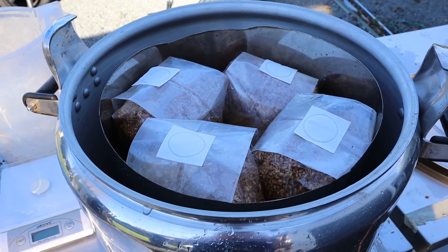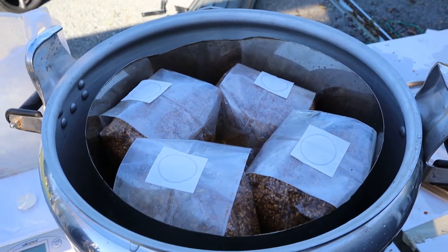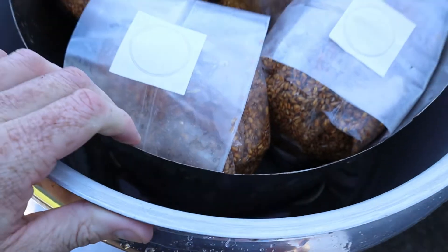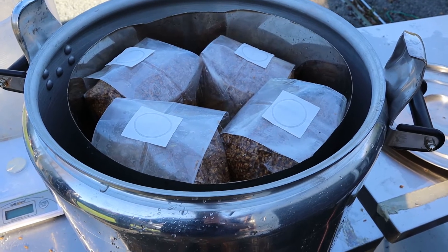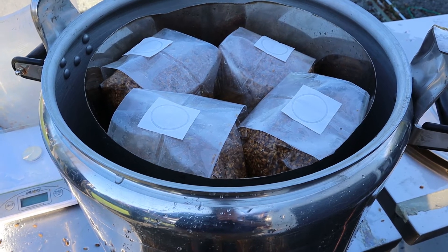There we have it — eight bags packed into my homemade autoclave sterilizer. We'll put them on the stove for two and a half hours to ensure they get sterile, then let them cool down for 24 hours, and tomorrow we will inoculate them.